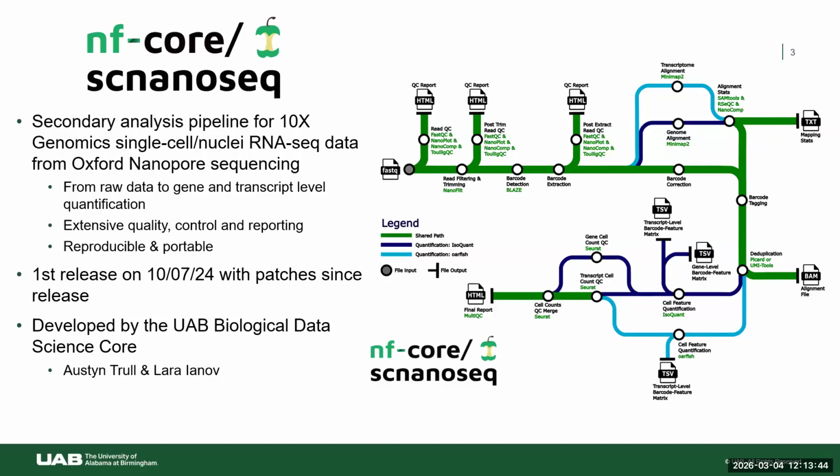To catch up people in Zoom, I'm going to briefly introduce NF-Core scnanoseq, and then talk a little bit about NF-Core and tell you all about the history of this particular workflow as well as the future. I'm not going to go into as much detail, for the sake of time. This workflow is for secondary analysis of 10x Genomics single-cell and single-nuclei RNA-Seq data, specifically targeted for the Oxford Nanopore sequencing instrument. So this is for long-read RNA.